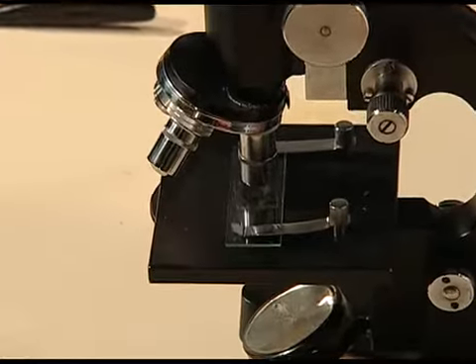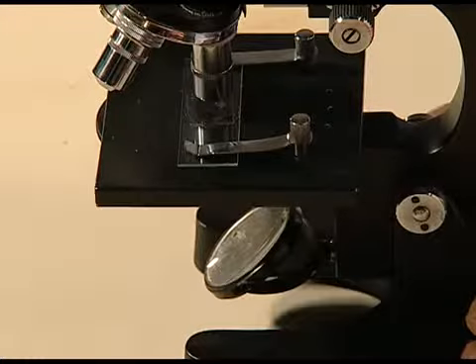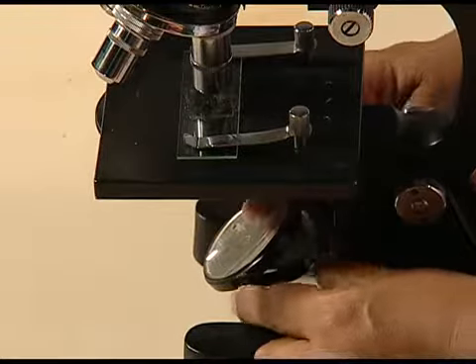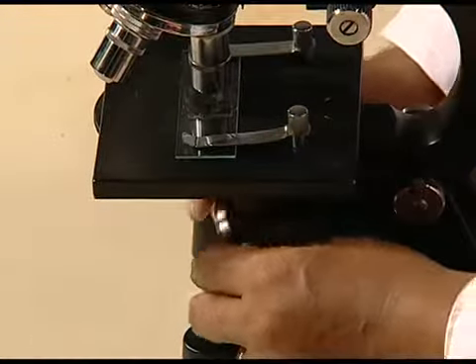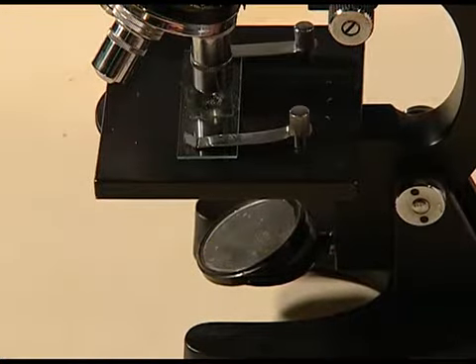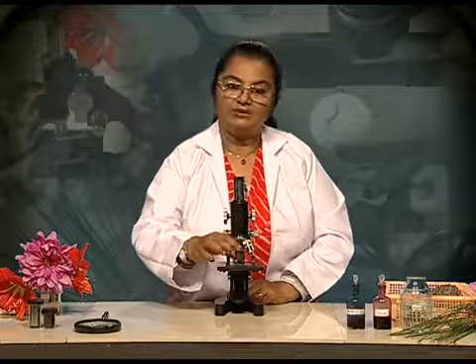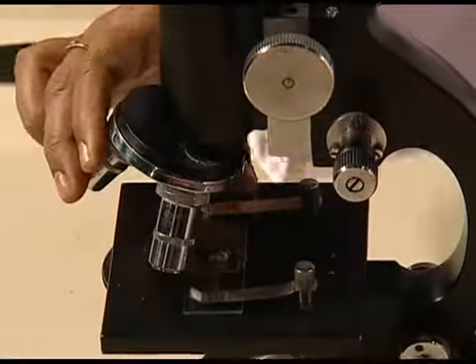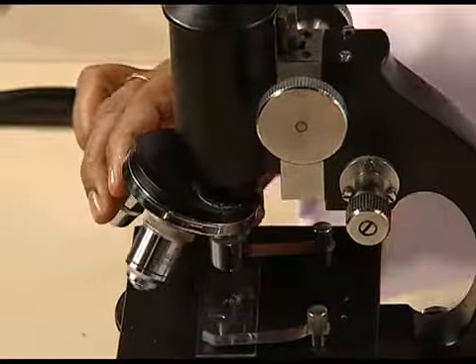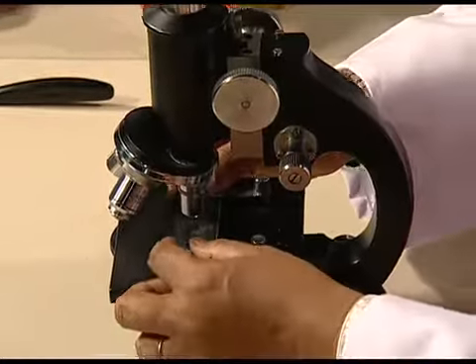Do not allow direct sun rays to strike the mirror. Use the plane mirror side for natural daylight and concave mirror for artificial light. When you are done, first bring the low power above the object. Remove the glass slide.